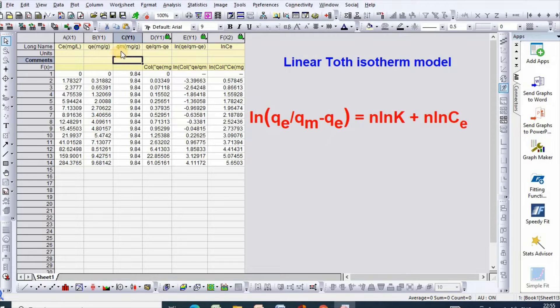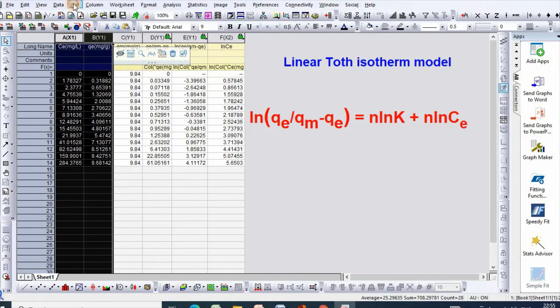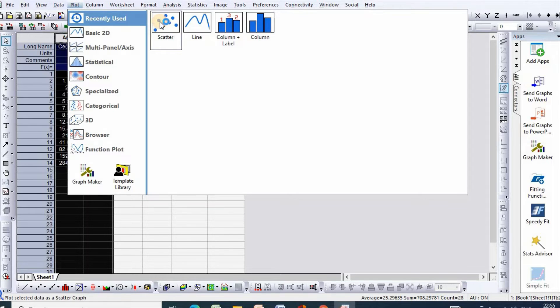So, in order to find out QM, just select this, go to plot, then scatter.